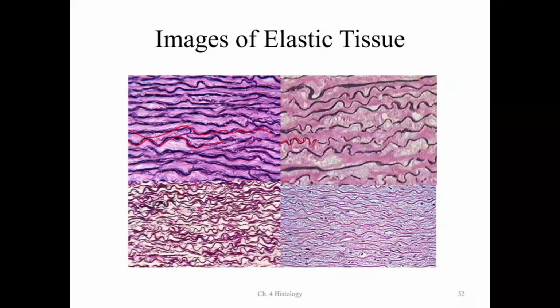Really looks like lasagna noodles. Okay? Lasagna. These all look like lasagnas. They look like lasagna. And you can see it really well in these images here. Lasagna noodle shape. How the fibers run like lasagna.